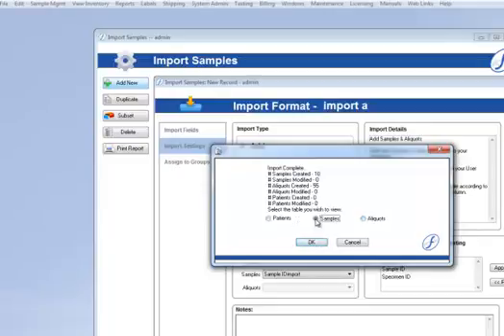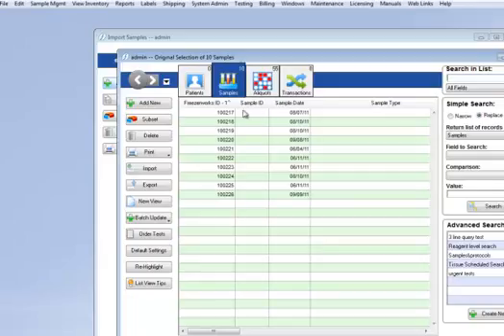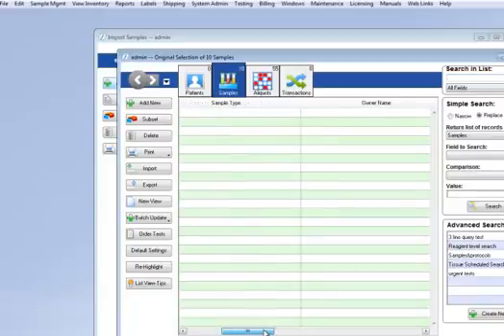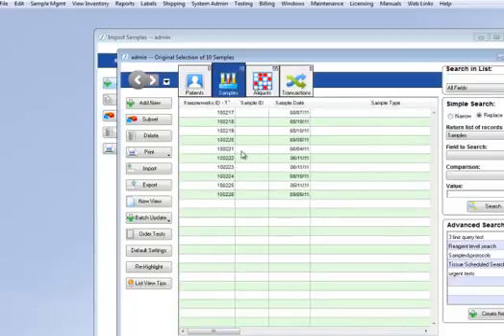I'm going to view these records that I imported by sample records using my list view. Let's go ahead and hit OK here, and now I will see a list view of the 10 records that I created, and here they are. Let's take a look at each one.